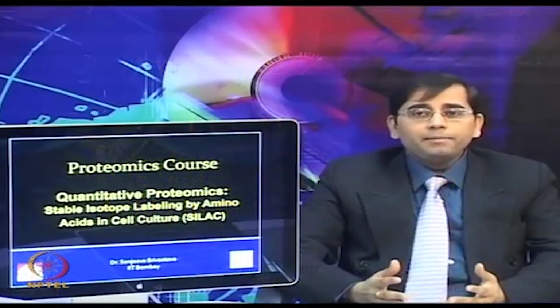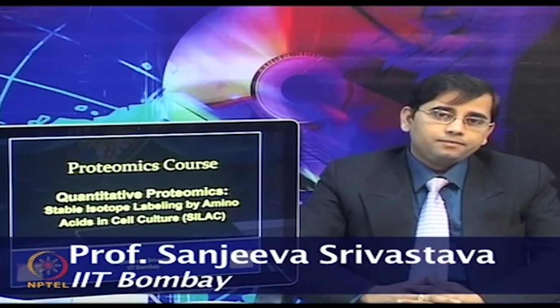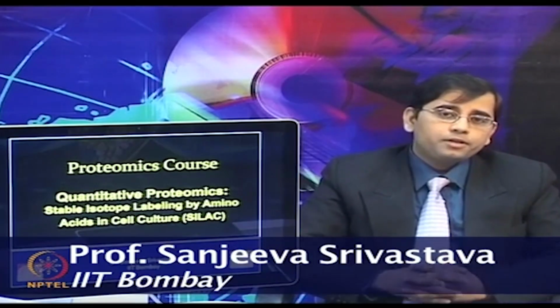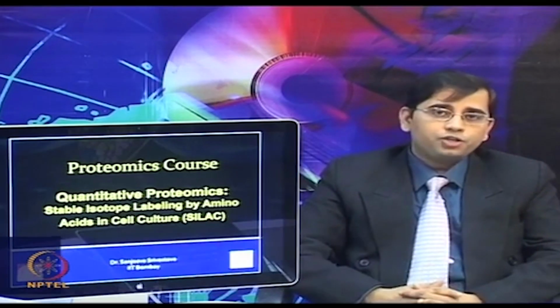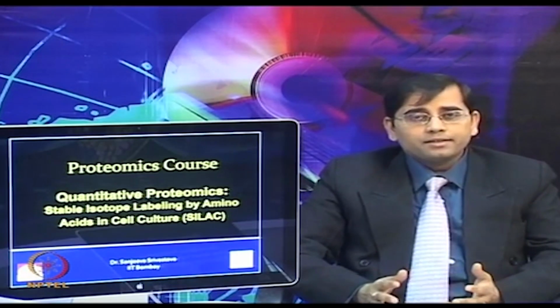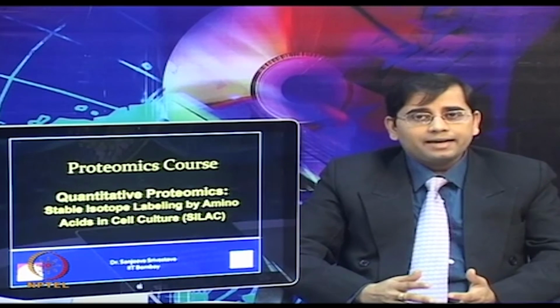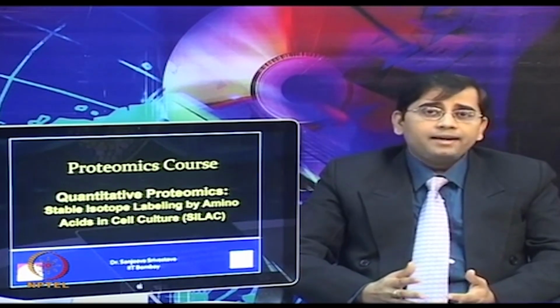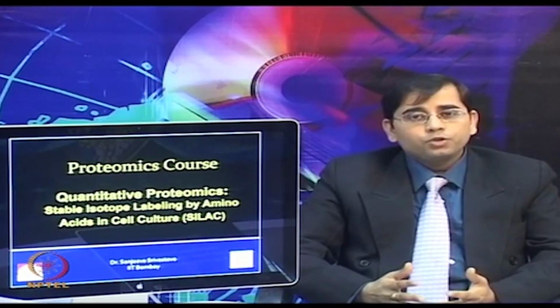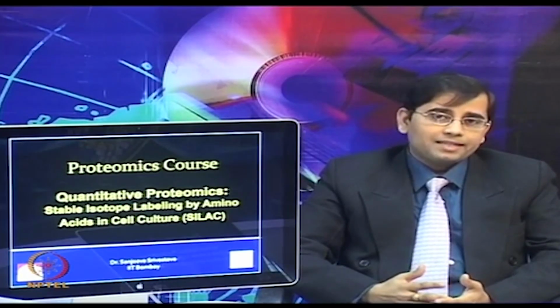The complexity and dynamic nature of the proteome present major technological challenges. Mass spectrometry advancements have improved the high throughput identification and quantification of proteins. The mass spectrometers have advanced significantly and are now offering opportunities to understand human diseases and discover biomarkers. MS has proven to be an extremely powerful tool to characterize protein complexes.